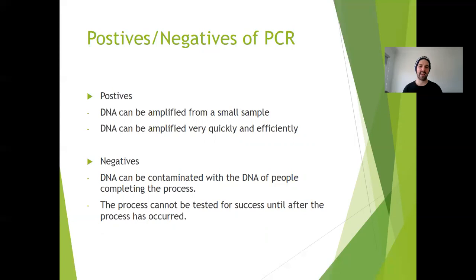And the other negative is that we can't actually test to see if it works until after the process has already occurred. So you might have wasted your time doing the PCR process, only to realize that some of your ingredients weren't correct, or maybe you had the incorrect primers, and you wouldn't know that until after the actual process has occurred.